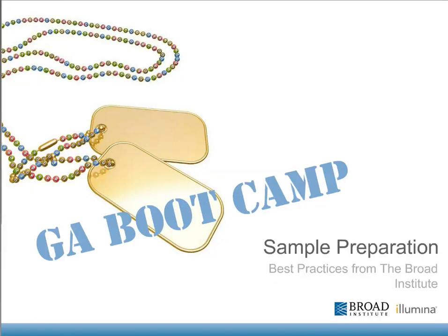I'm a molecular biologist at the Technology Development Group here at the Broad, and I'm going to be talking to you about sample preparation today. In this presentation, I'm mostly going to be talking about genomic DNA processes, because that's mainly what we do here in our group at the Broad. But a lot of these techniques can be applied to different sample types. However, mainly I'm going to be talking about genomic DNA. Sort of the Broad's best practices and some tips and tricks that we like to employ.